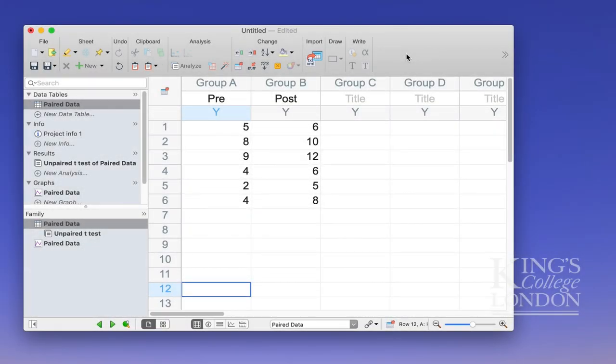Hello, we've seen in other tutorials how to undertake an unpaired t-test in GraphPad Prism. But what if your data are paired? What if we're measuring the same parameter pre or post-treatment and we want to analyze the difference between our two groups?